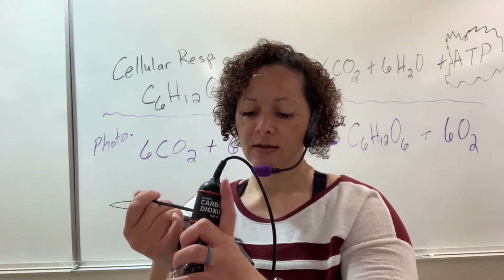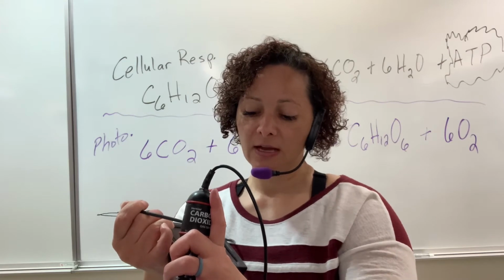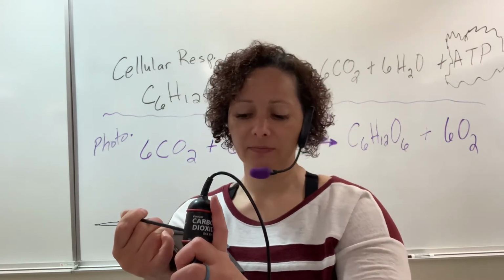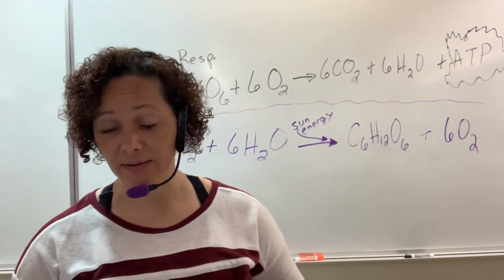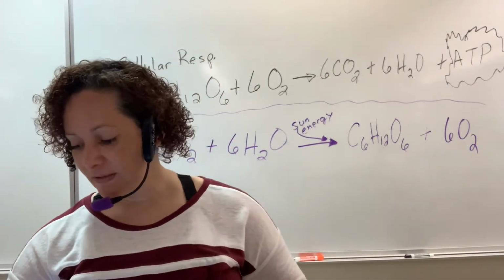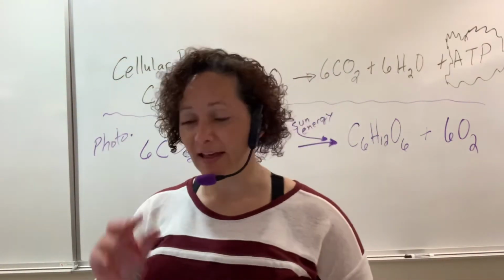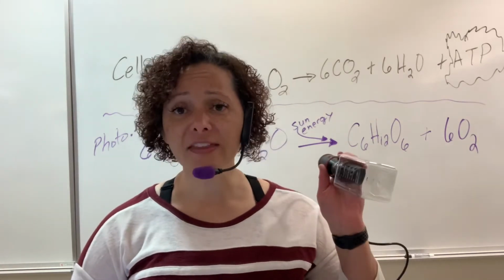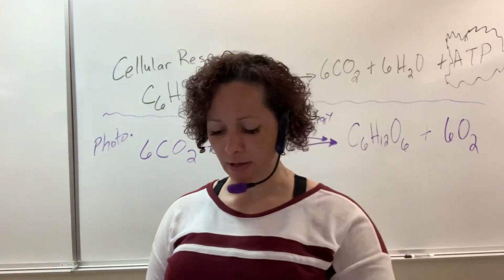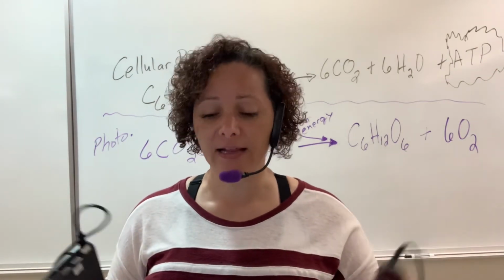Perfect. Now I'm looking at my parts per million on mine, and you're trying to get about 380, okay? It's going to toggle. It's not going to stay 380 all the time. I'm just letting you know that. If it toggles somewhere around 400, 420, or 320, something like that, you're good, okay? So with that, this is nice and calibrated. Don't unplug it. The moment you unplug it, you're going to have to recalibrate it.